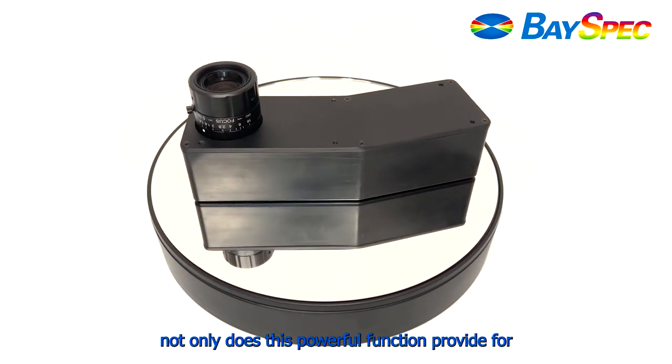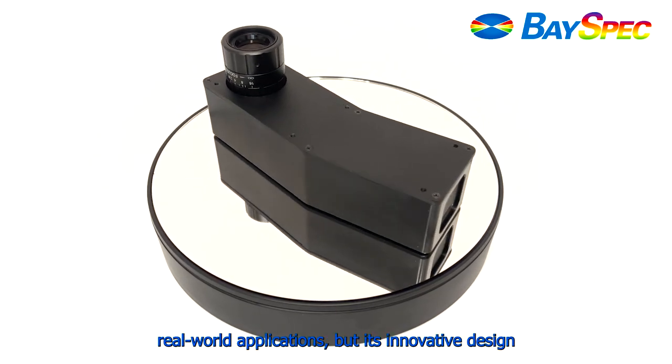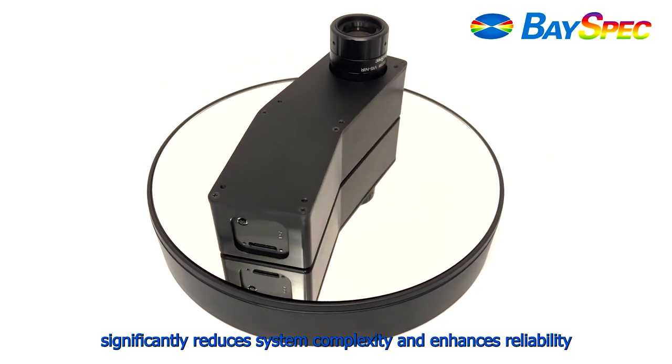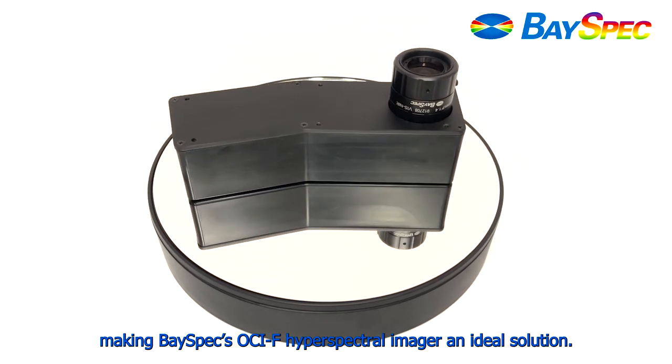Not only does this powerful functionality provide for real-world applications, but its innovative design significantly reduces system complexity and enhances reliability, making BaySpec's OCIF Hyperspectral Imager an ideal solution.